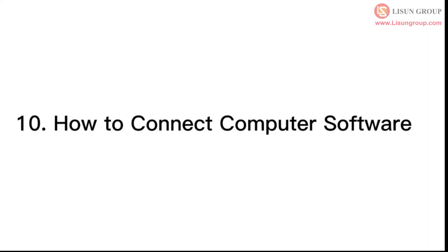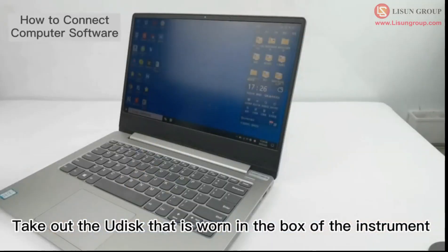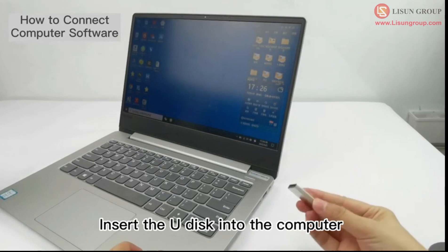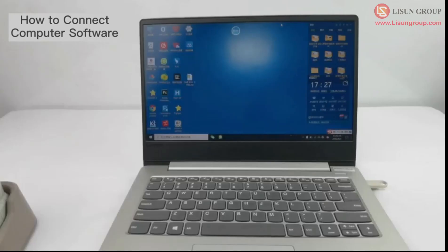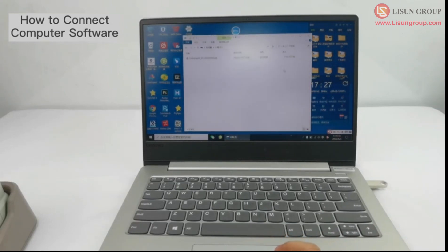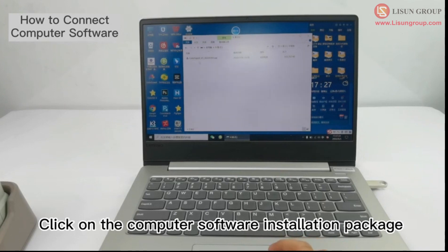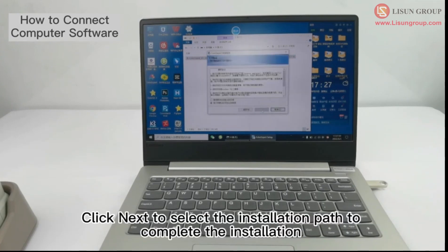How to connect computer software. Take out the USB drive that is included in the instrument box and insert it into the computer. Click on My Computer, click on the USB drive, and click on the computer software installation package. Click next, select the installation path, and complete the installation.